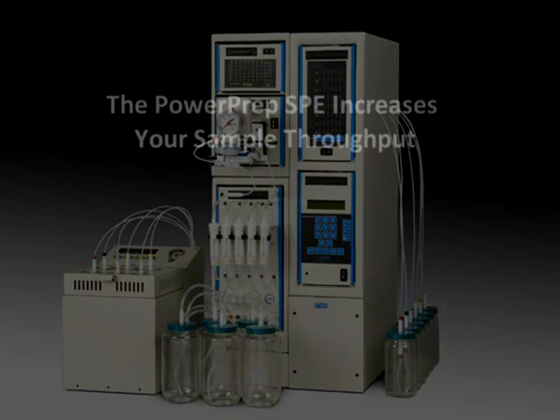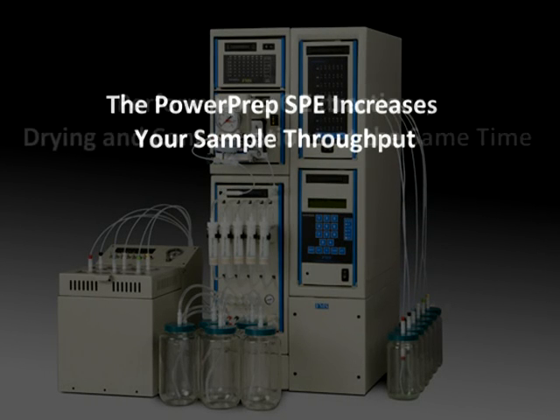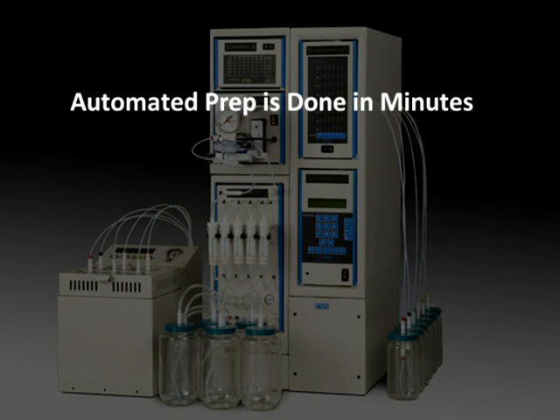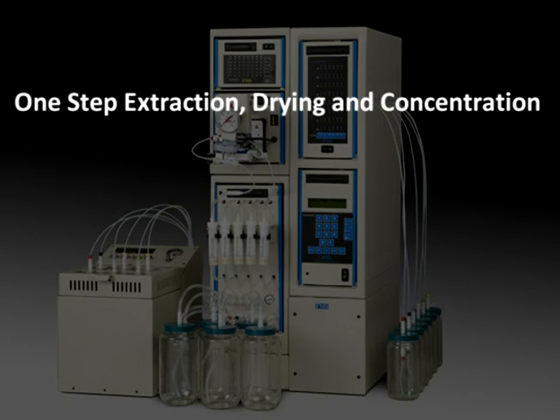The PowerPrep SPE increases your sample throughput. Perform up to six extractions, drying and concentrations at the same time. Automated prep is done in minutes. Five samples per module for up to 30 sample extractions. One step extraction, drying and concentration.